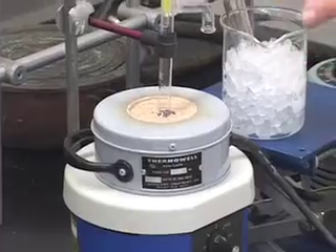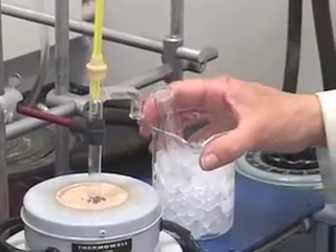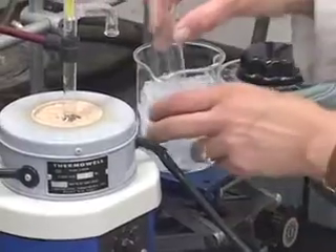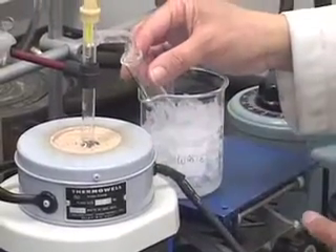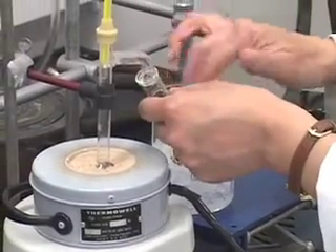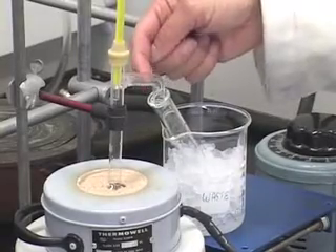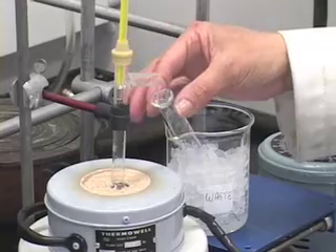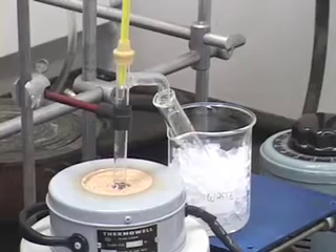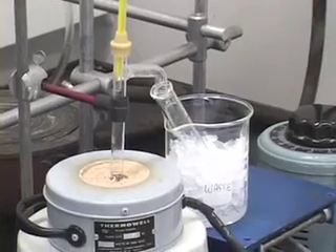Now the round bottom flask is sitting in the heating mantle with sand. At this point, I want to make sure that the side arm is sitting inside my collecting tube, so let us adjust the level. Notice that the entire mouth of the side arm is inside the test tube. You don't want to create an airtight situation — that would make a closed system. You do not want to do the distillation under a closed system, but it should be sitting well inside the reaction tube.